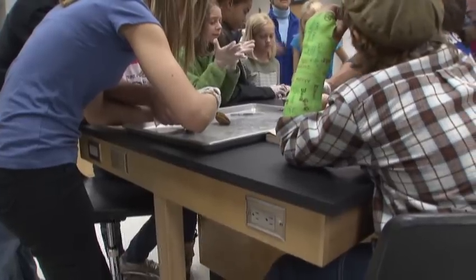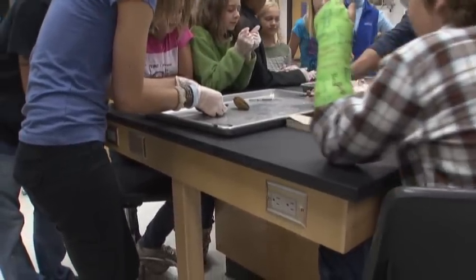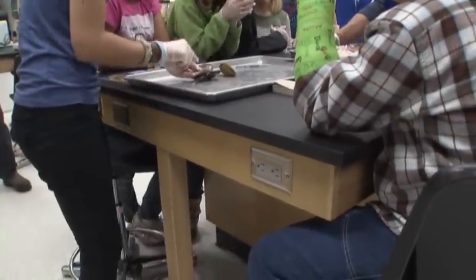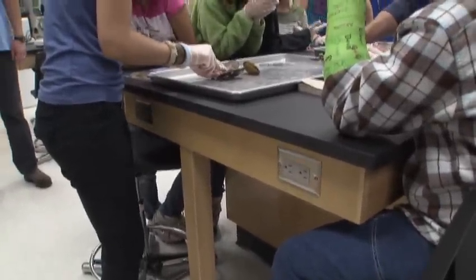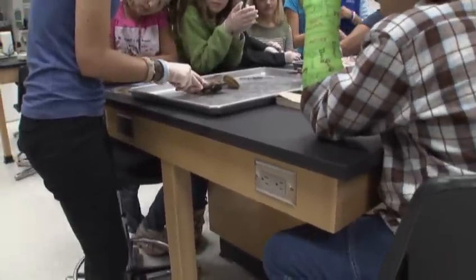Okay, Courtney looks like she's got it open here. But they don't have a brain. Well, you can call it a ganglion if you want, but it's not a brain like you would think of a brain. They can open and close. That's about all. That's about it.